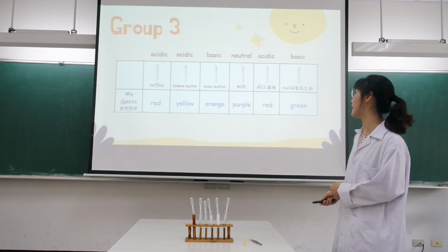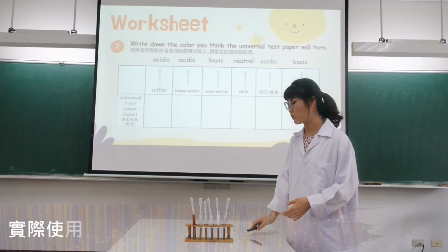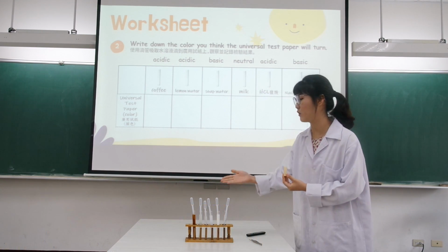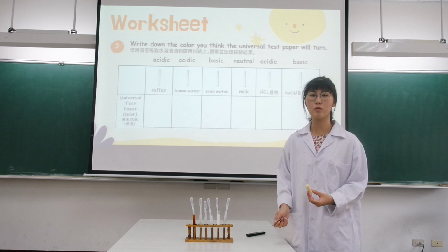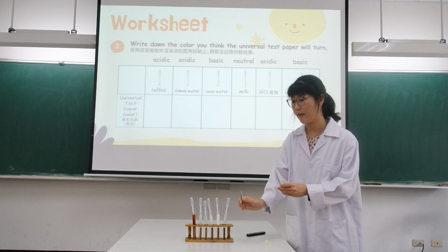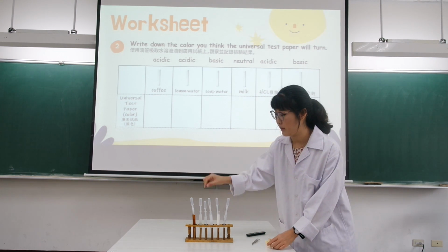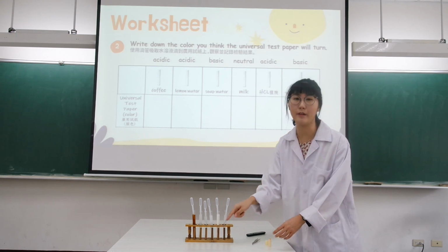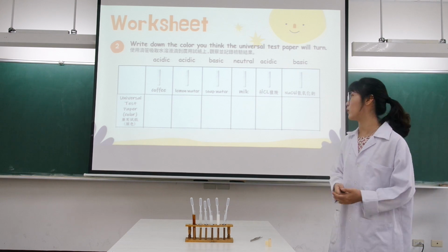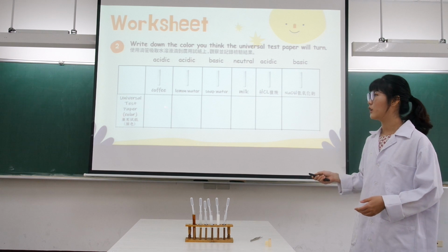Then use the test paper, and next use a dropper to drop the solution onto the test paper. Okay, I'll give you 10 minutes to do the experiment. Remember, I'll give you 10 minutes. And stop. Very good. So now let's look at Group 4's worksheet. The universal test paper turns yellow. Very good. How about Maria?